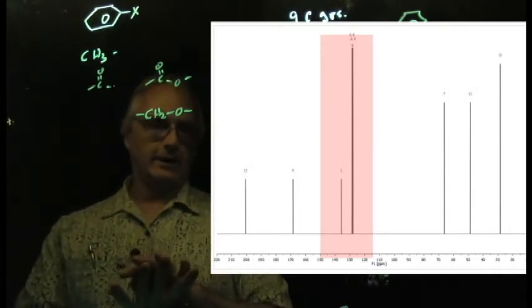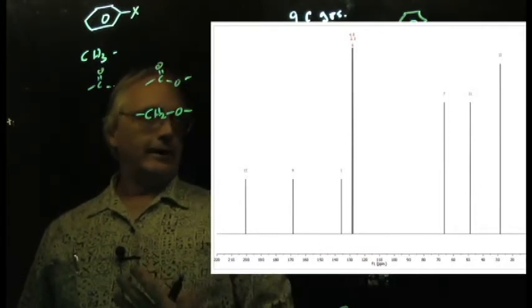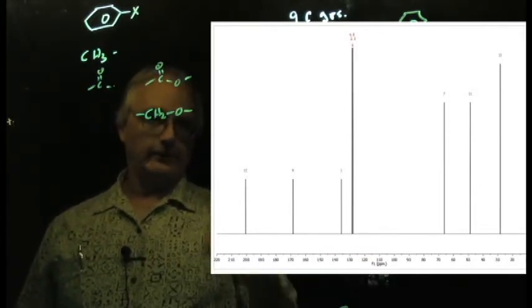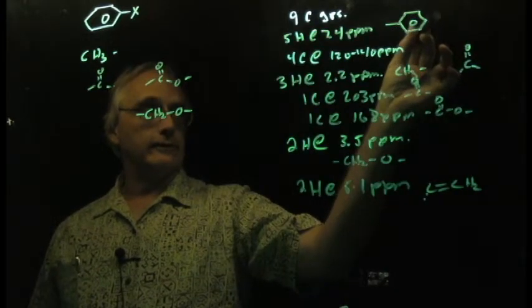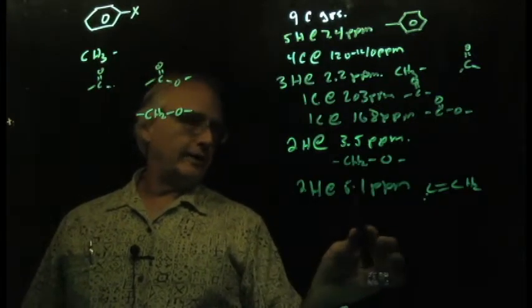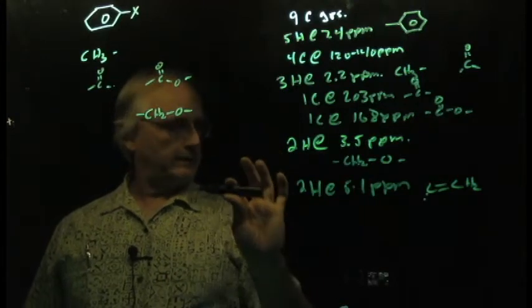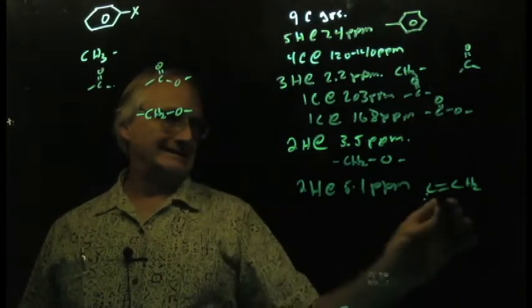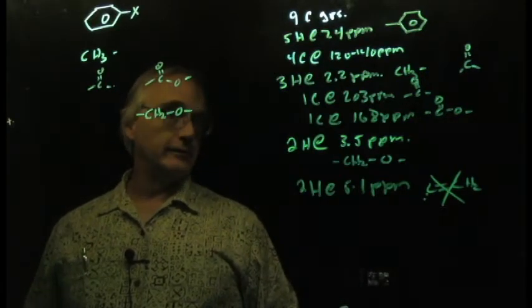They come in the same chemical shift range pretty much. But in that area, there are only 4 carbons, and they're already accounted for. They're the benzene ring. There are no other carbons there. So while this chemical shift makes me think about an alkene, looking at the carbon spectrum makes me think, nope, I don't think that is one of my puzzle pieces.